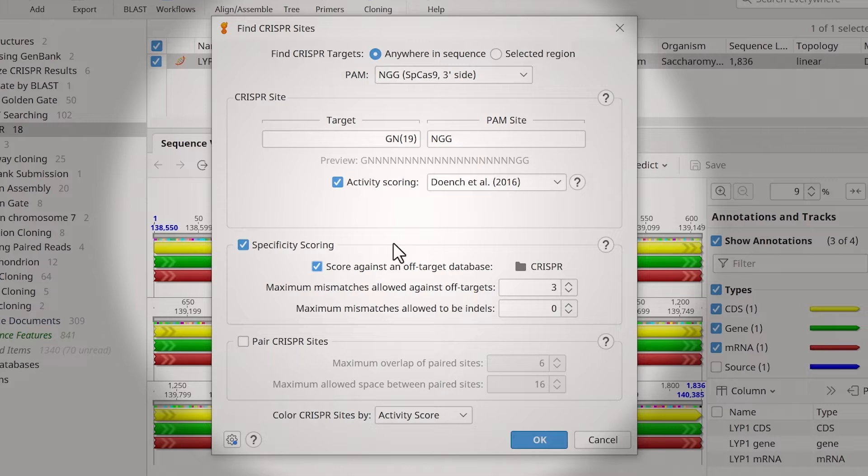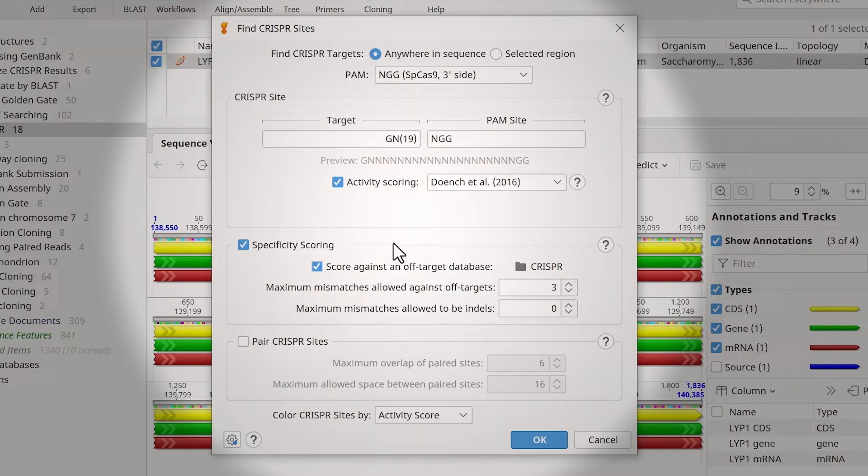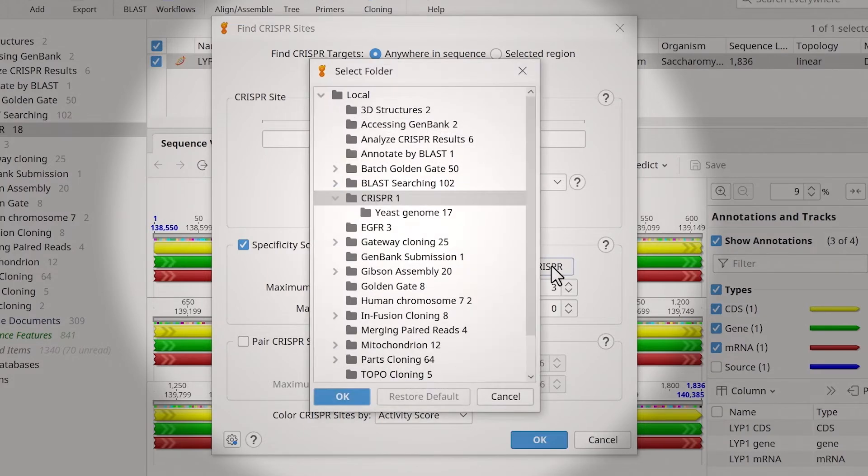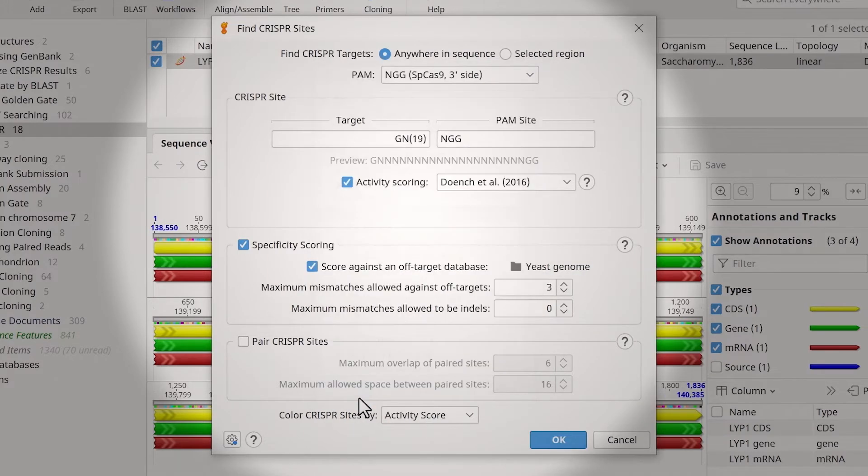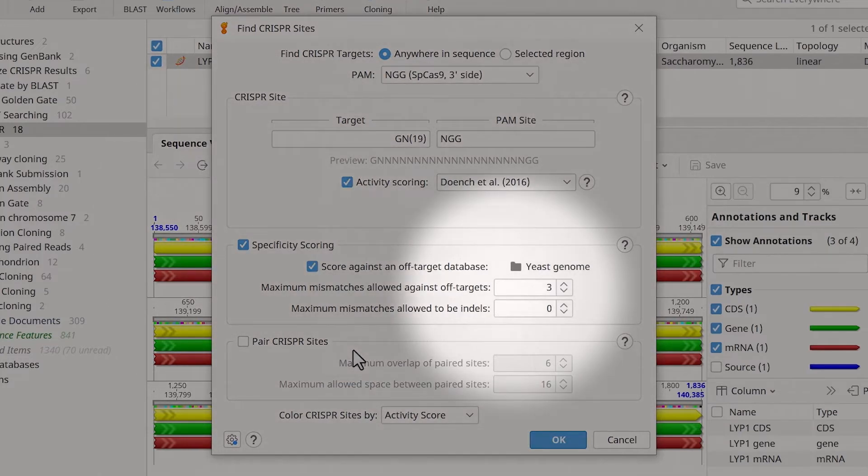You can make an off-target database by creating a new, empty folder in your Genius database and importing the sequences you wish to use. To specify a database, select the folder icon and browse to the desired location. You can specify the maximum mismatches allowed for off-targets and indels.